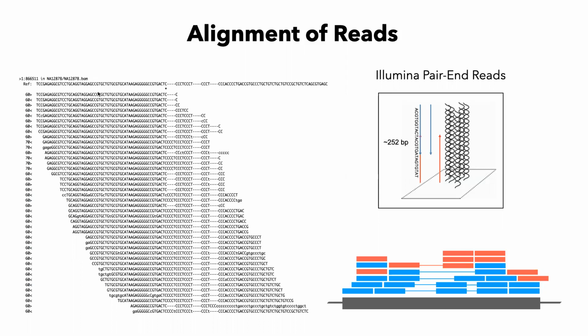You can see the BAM file right here. So this is your reference portion, and these are the individual reads. And you can see that it's done by aligning the sequences and introducing gaps wherever those gaps are either present or not present in your reference read.